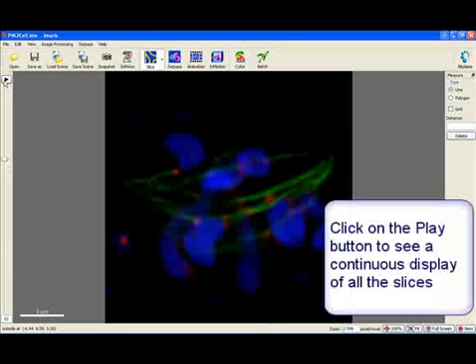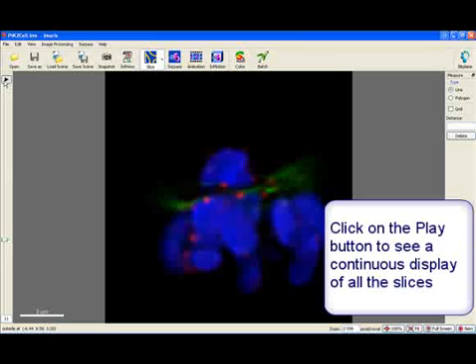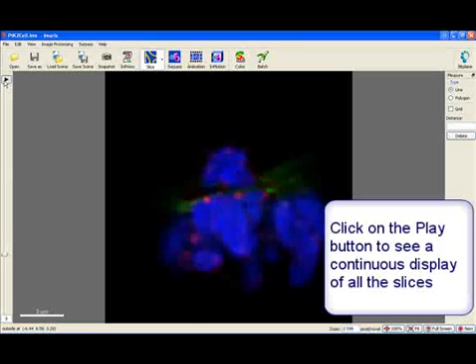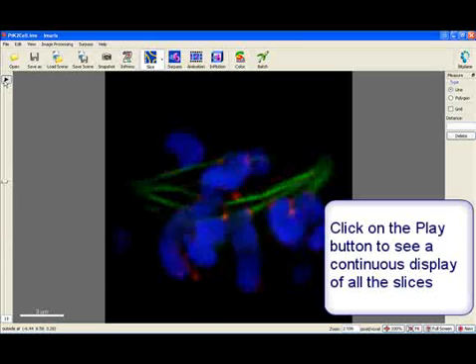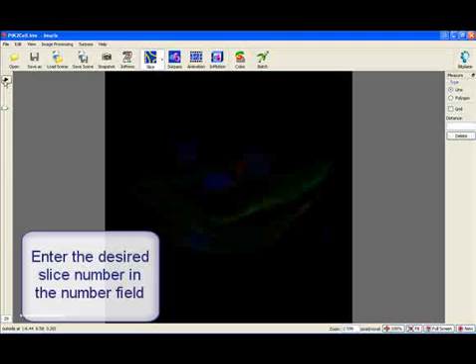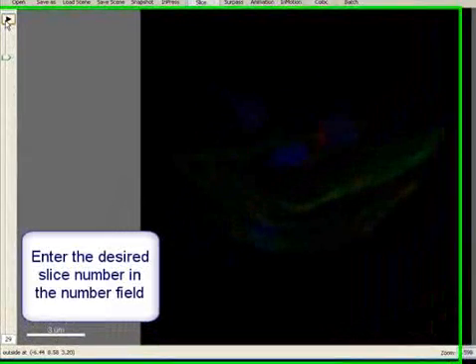By using the play button, a continuous display through all the slices in the stack is available. The number of the desired slice can also be entered in the number field at the bottom of the slider.